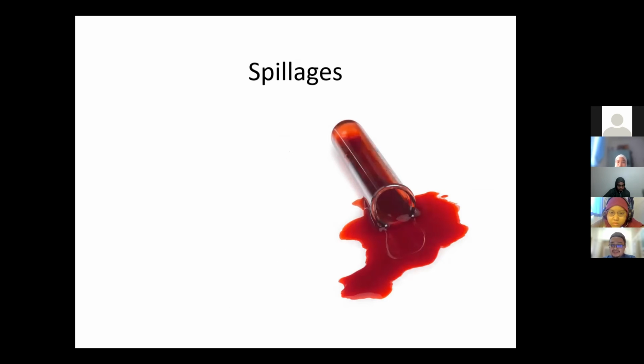Okay, spillages. In terms of blood spillage, if you are in the hematology lab, or any other chemical reagents, dye, pewarna, pencelup. So we'll be using dye in our hematology lab when we want to stain. So awak tengok nanti our benches more or less clean lah, because we practice this. Bila spill je kita lap quickly, kita tak tunggu dry. Bila dia dry nanti awak punya bench tu awak tengok dia jadi peta dunia. And we don't want that. So it must be clean.